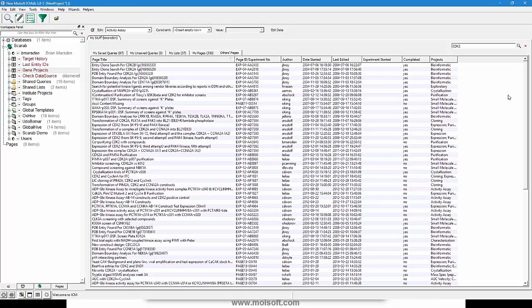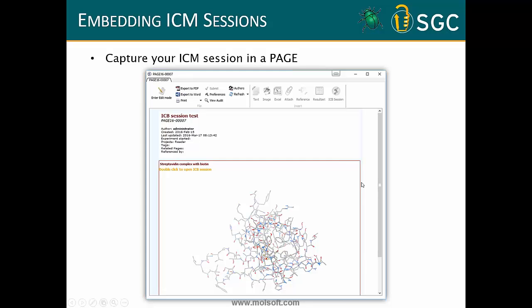Great. And we had a couple of questions about things, when you add things into Scarab, how interactive they are. But another one was, for example, when you import Microsoft Excel, is it fully functional within Scarab or only viewing? No, only viewing, because, well, okay, there are two reasons why we did it this way. The primary reason is, although it is possible to embed Excel into a Windows program using something called OLE, this is not supported under Linux because there is no Excel, and not supported under Mac because actually Microsoft didn't provide the capability for doing that. So as a consequence, we didn't go down that route.